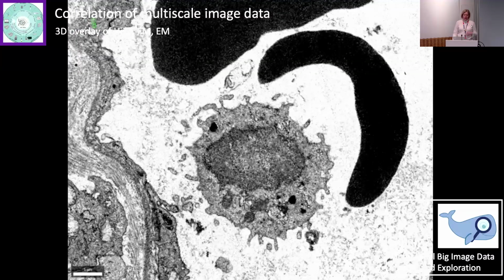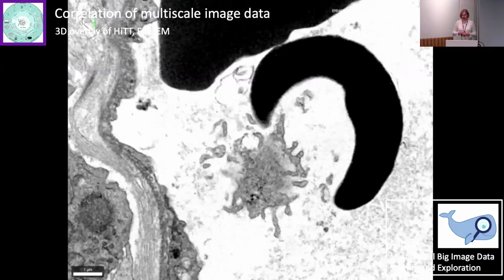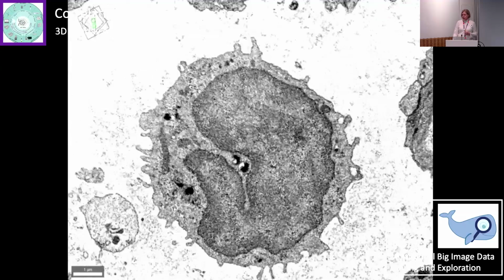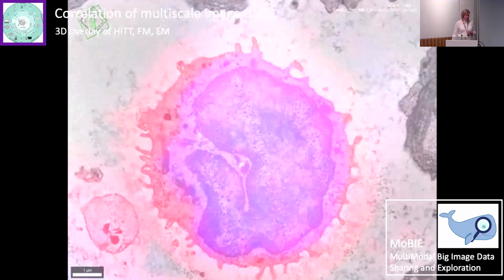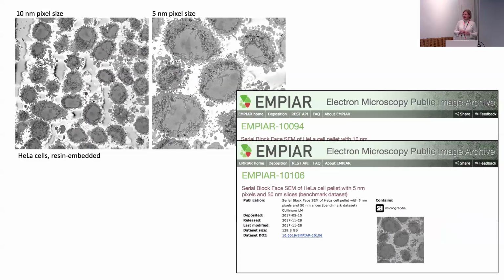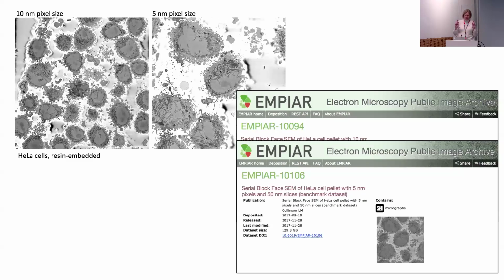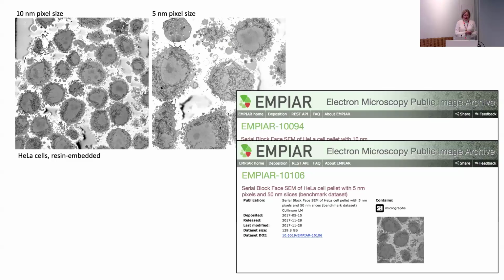So we now have experts in the lab, but it takes a little while to get up and running with new software solutions. And something that's key for us here is also the OME-ZARR file format, which I think has largely been adopted by the community now, which is a very important advance. And then we have Matthew here as well from EMBL-EBI. We have deposited a lot of data at EMBL-EBI in the BioImage Archive. This is one of our first. It was the slide I happened to have ready.